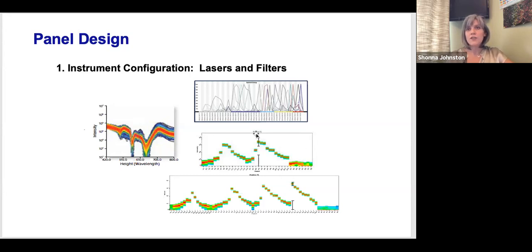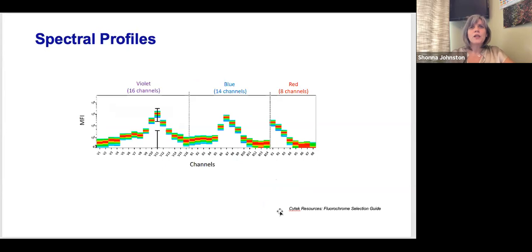And actually, you can even see here, the differences between a 3-laser and a 5-laser system are quite significant, I think, as well. So you need to be able to understand it. You need to be able to read it. Is it collinear lasers that you're working with? Are the arrays specific to the lasers or are they not? And as I say, it's really important that you actually have some understanding.